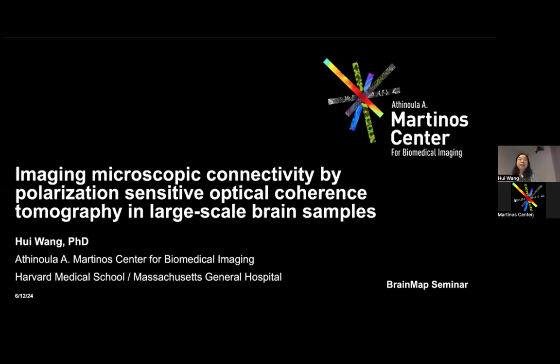It's my great pleasure to be here talking about our recent progress in microscopic connectivity by using an optical imaging technology called polarization sensitive optical coherence tomography. And the goal here is to use this technique to image large-scale brain samples to really better understand the connectivity.